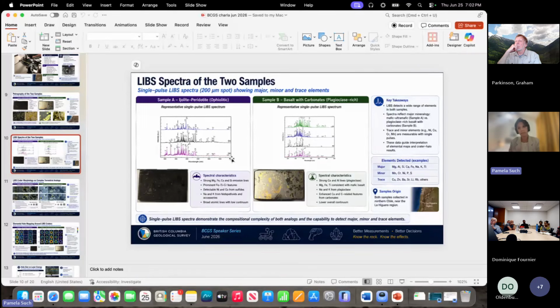You clean that core up to 2 millimeters. So you basically repolish that core, and then you analyze it with the other instrument. Or if you have the option, just leave LIBS to the very last. Also, the scales of work. LIBS, I show you, LIBS can be like a point in a rock, or it can be a map in a whole core. So the scales of work can change with the same instrument.